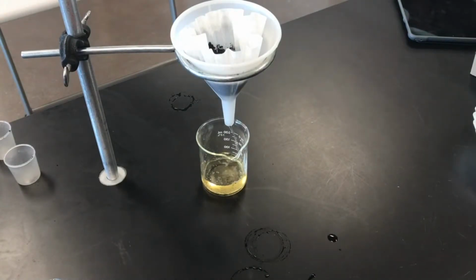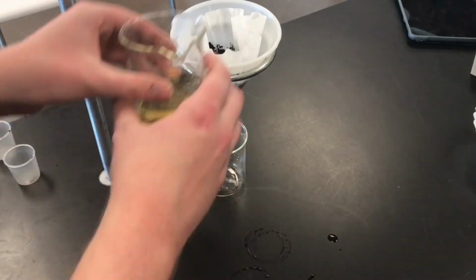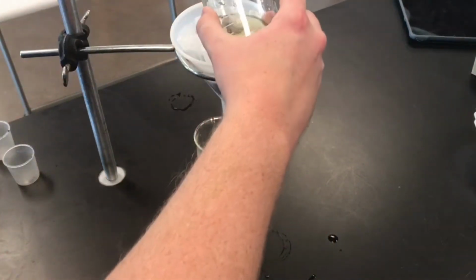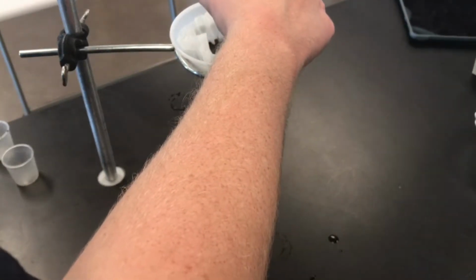So you're going to let it filter out for just a little bit, let this filter through the soil. You're going to run this 3 separate times for each procedure. So you're going to run it through, and in just a second, when most of the solution is filtered out, we're going to run another trial really quick here. So all I'm going to do, once it's ran through a decent amount, I'm just going to replace my beakers, and I'm going to pour it through again. So you're going to want to do this 3 times for soil A, 3 times for soil B here.